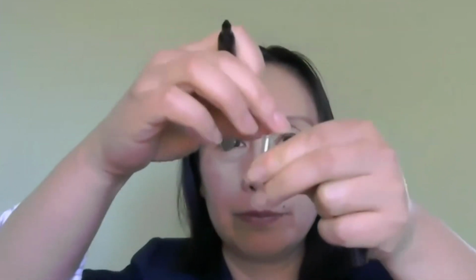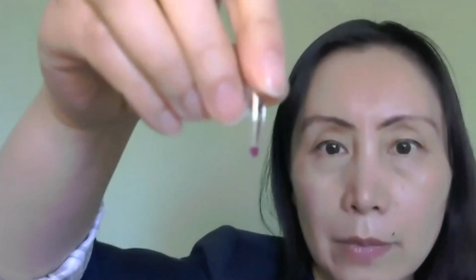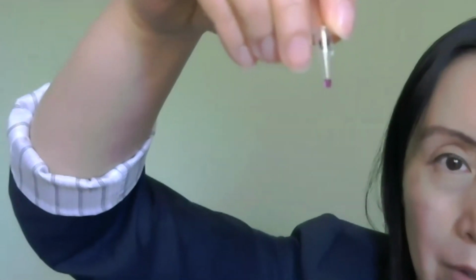All right, then I close this tube, and I will label it uncut with a U there. U means uncut. Can you see the U I labeled on it? Yeah, that's it. Okay, then the other tube, I will put enzyme there.